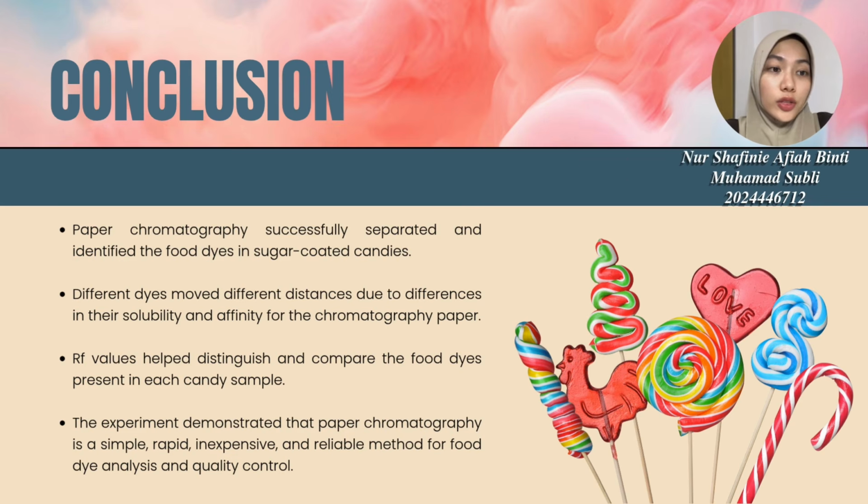Overall, paper chromatography is a simple, rapid, and cost-effective analytical technique. It plays an important role in food quality control by helping identify food colorings and ensuring the food products meet safety and quality standards.